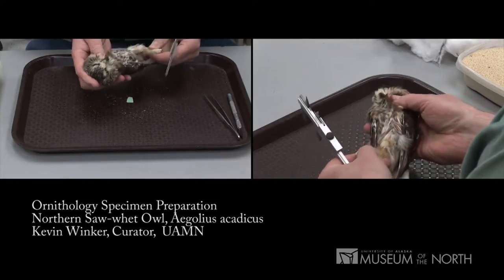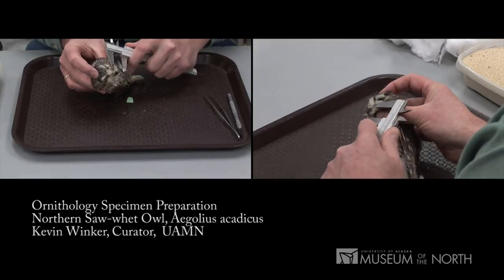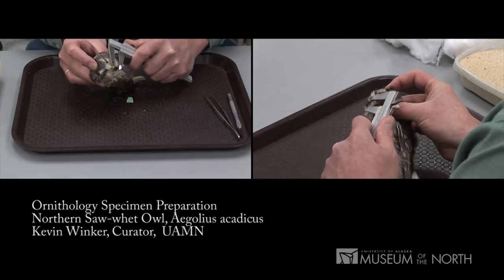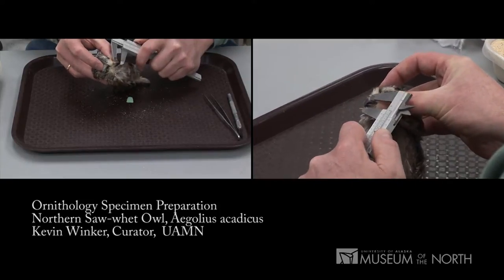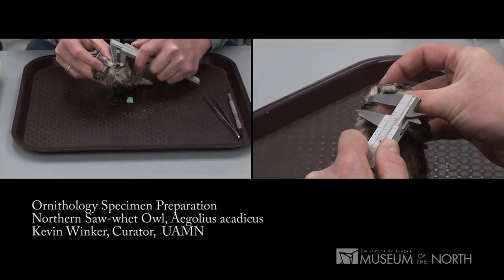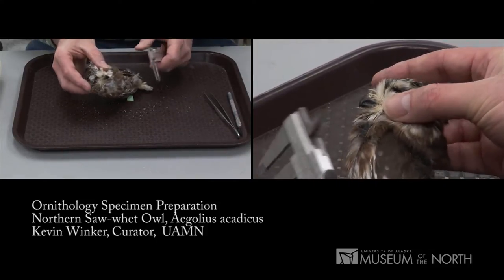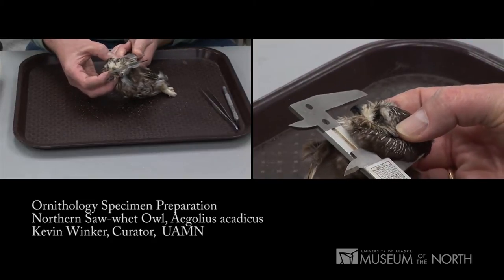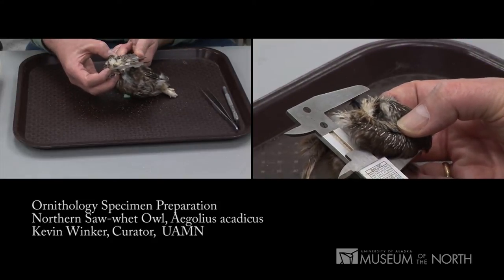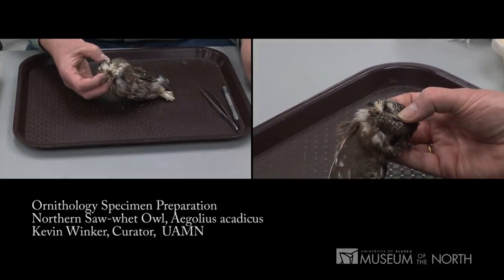I've also measured the bill, which is measured from the anterior edge — the front edge of the nares or nostrils — to the tip. It's a little difficult to see given the fluffy face of the owl. I've also measured the height and width of the bill at that point, and finally the length of the skull, because in the skinning process we'll be breaking that skull to prepare both the skin and the partial skeleton.